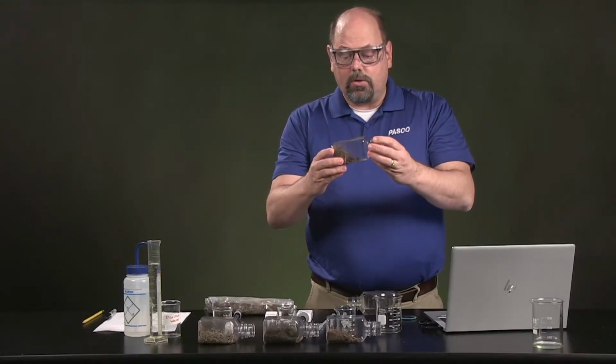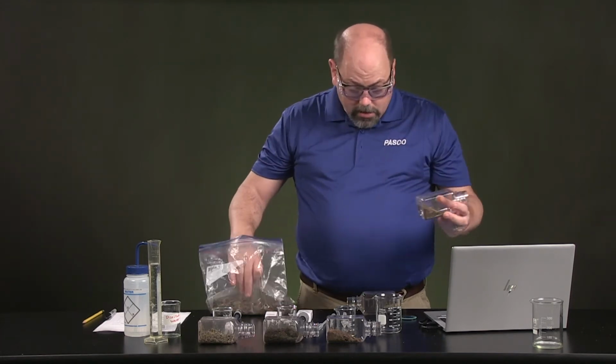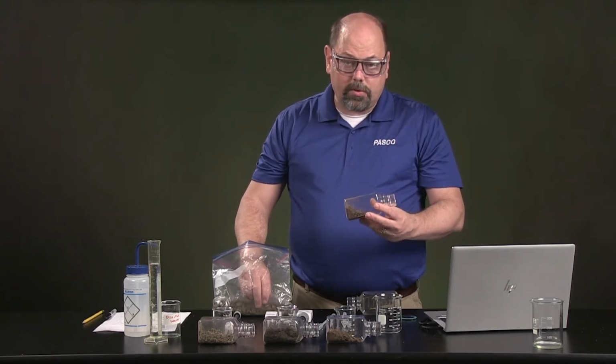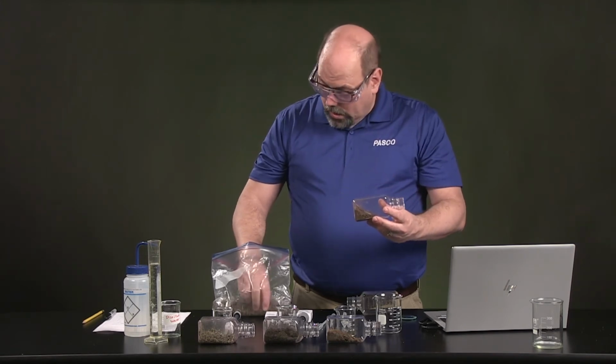And here's the soil that we used in the grasslands. I've got the other 3 that will be here for you if you are doing this from home, for instance. If you open up the lab that goes along with this, you're going to have all of these 4 readings. I'm going to just demonstrate this process.